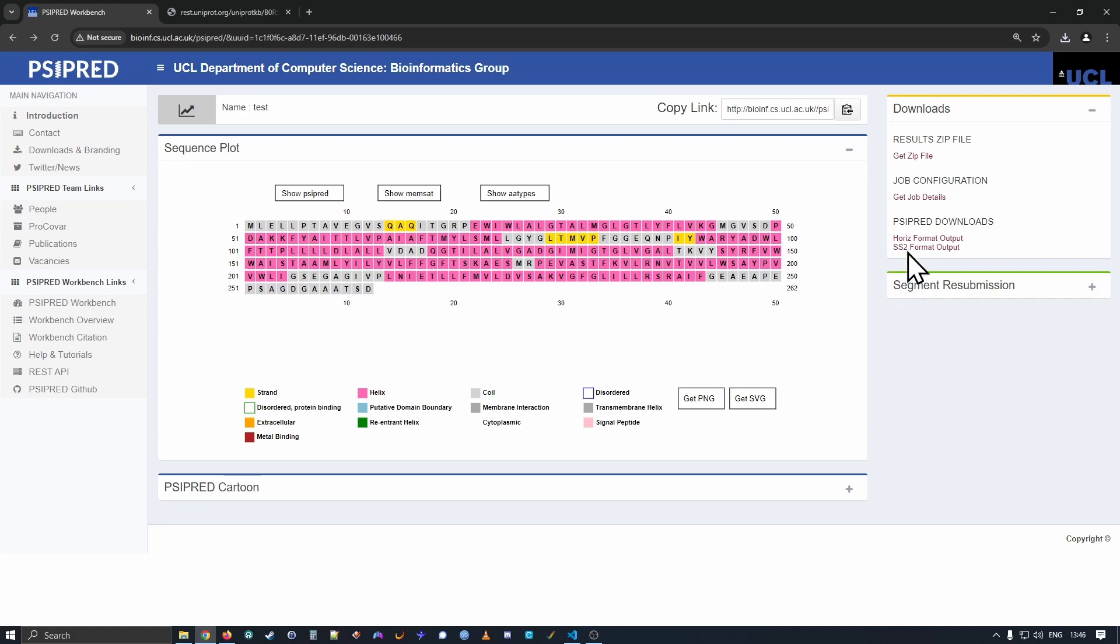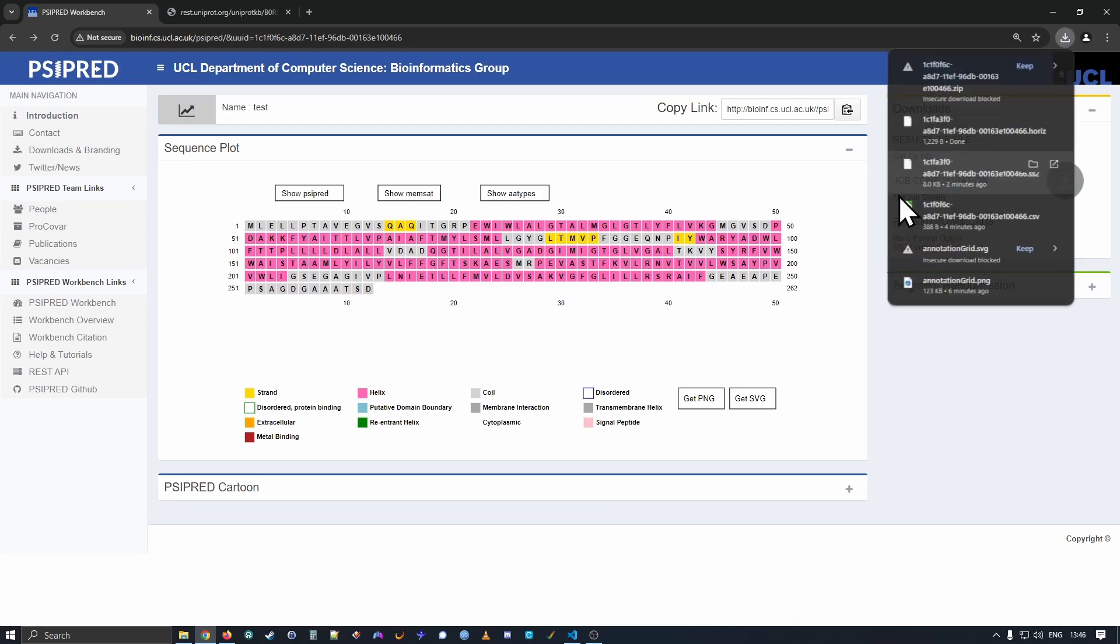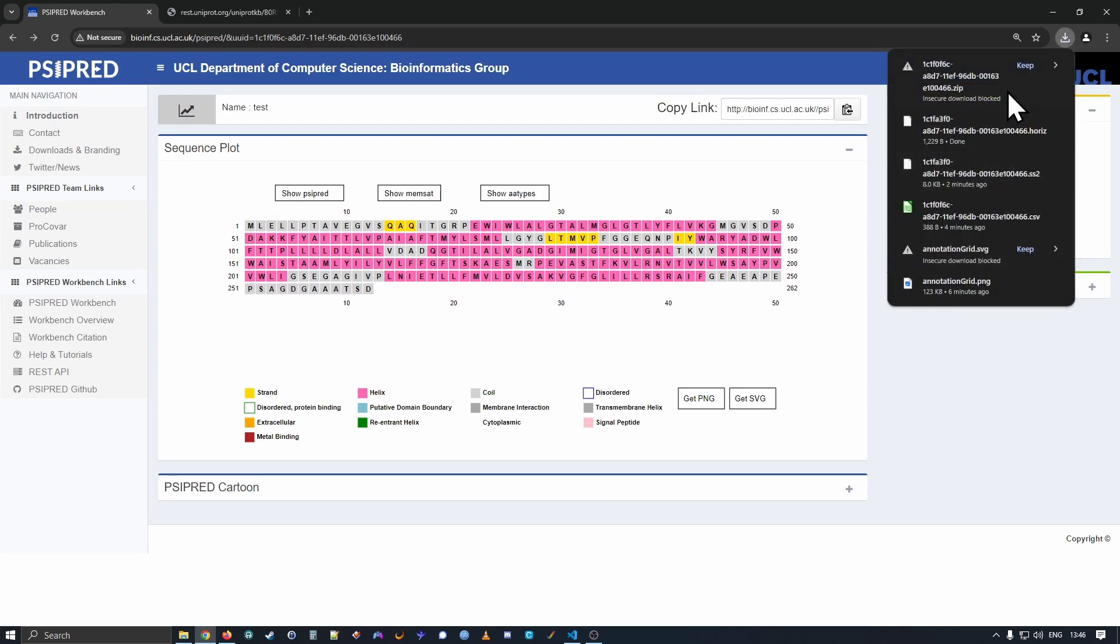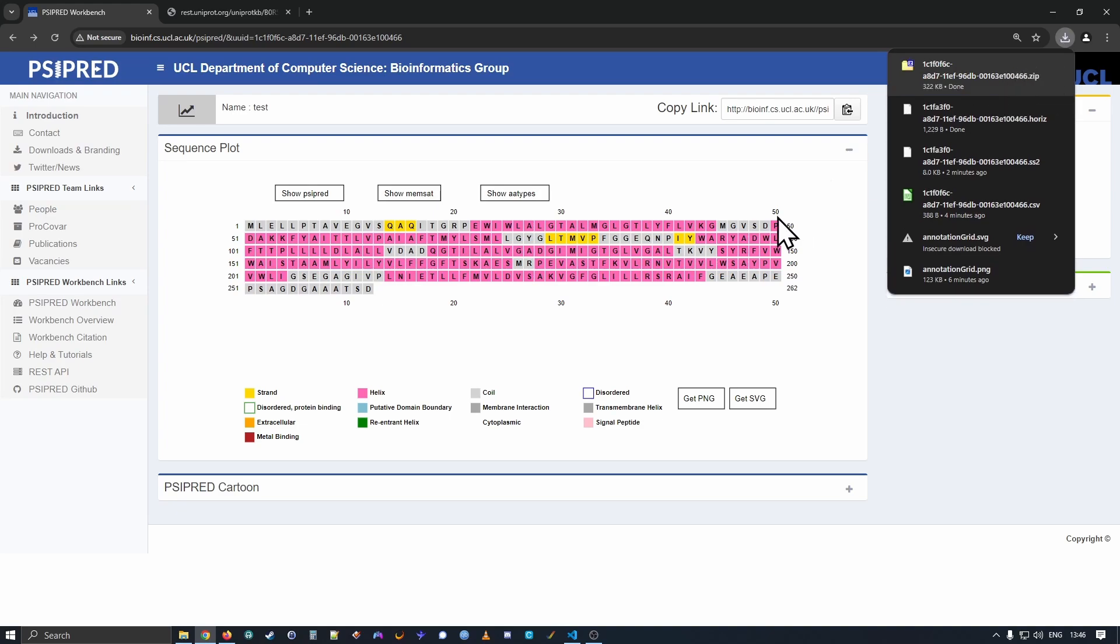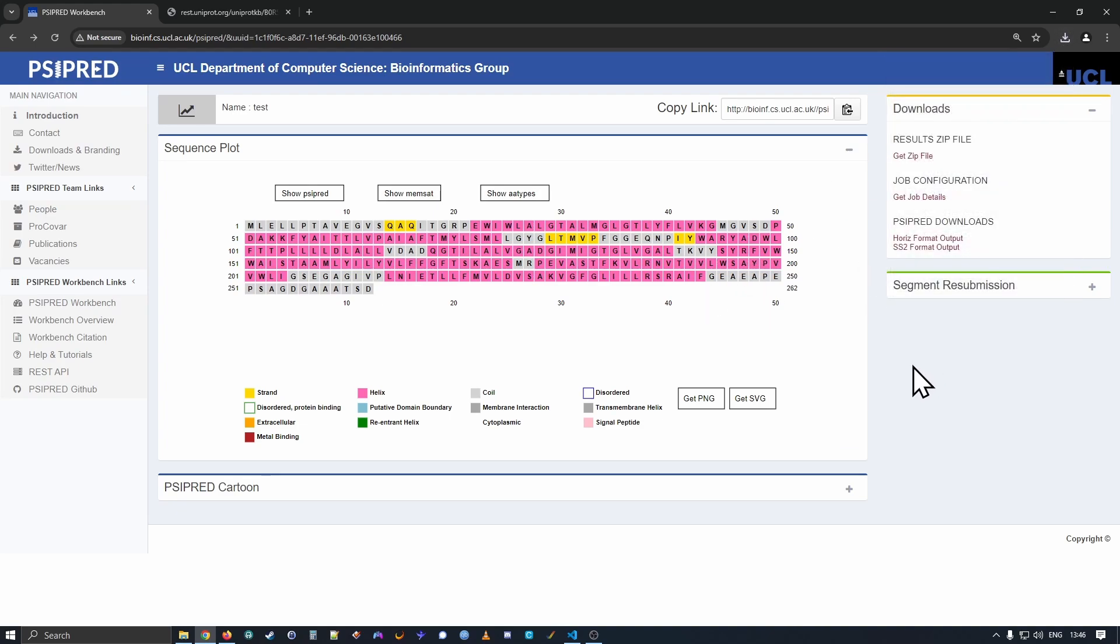So lastly here, you can download files individually if you're only interested in specific output files. But if you would like both the job configuration and all of the output files, you can click the get zip file link. And you can download a zip file of all of the different outputs. And so that concludes our brief look at the secondary structure prediction method.